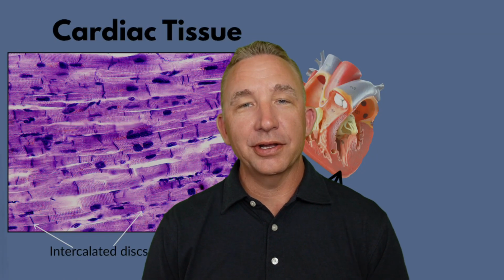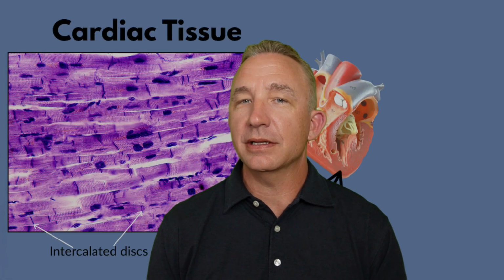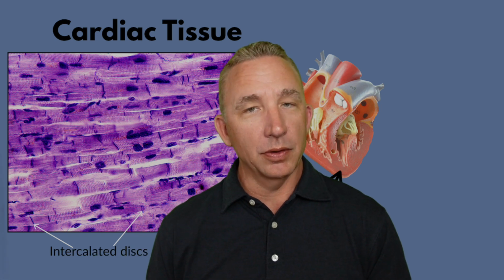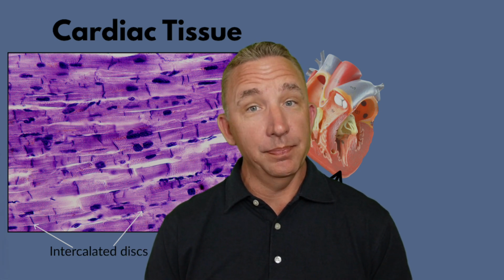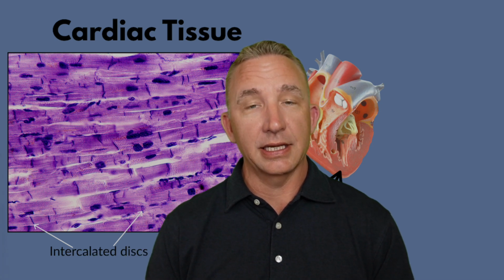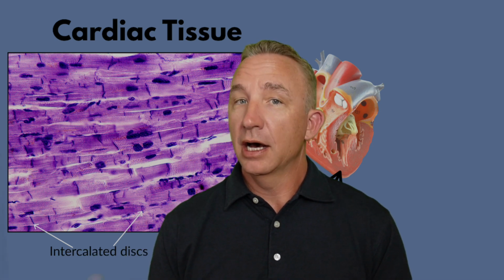Let's cover the cardiovascular system, and we'll start by looking at the microscope slides, the histology of the different components. We'll look first at the pump, the heart, then the vessels, arteries and veins, and then the actual fluid, a blood smear.